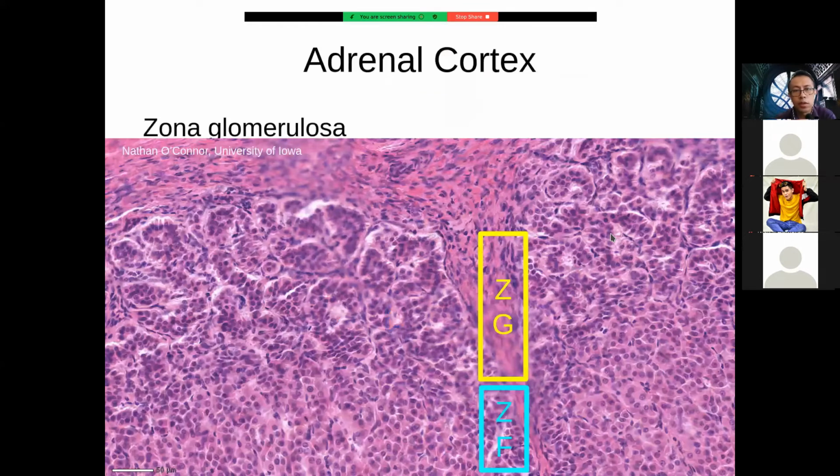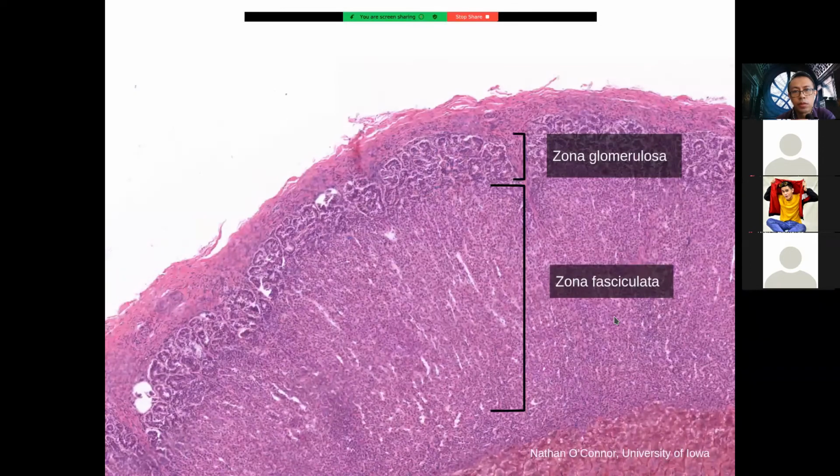So the zone of glomeruli looking things gives rise now to a straightening out of those cells into the zona fasciculata. This is the zona glomerulosa over here. For the zona fasciculata, you can imagine if these are clumps of spaghetti, here you straighten out the spaghetti noodles.